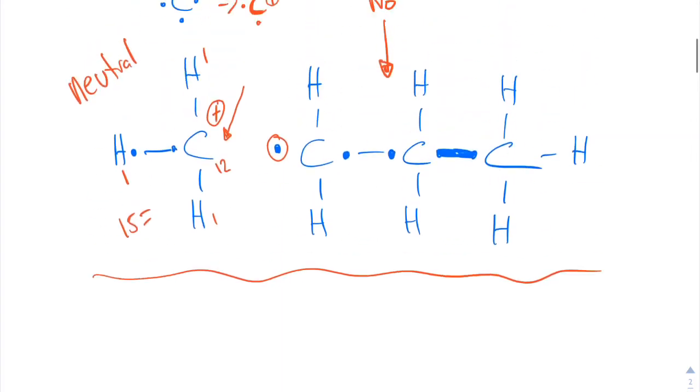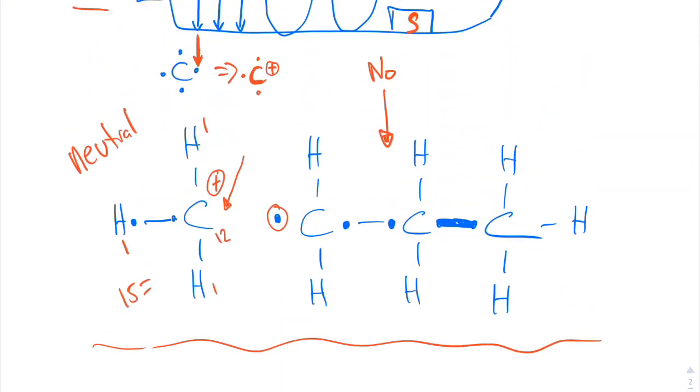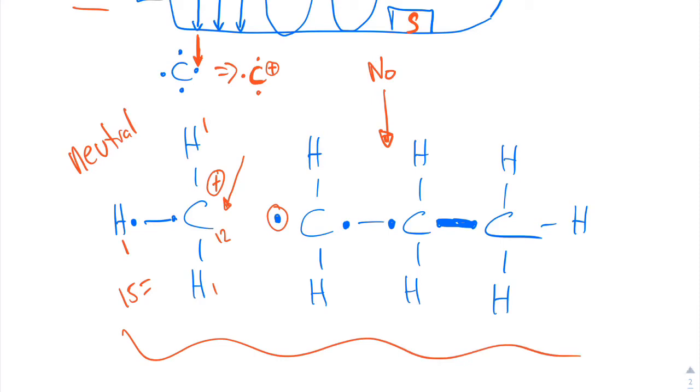It's like when we were breaking this thing apart up in here, when this was getting broken, it didn't smash an electron out of the middle and send just half of it through. It's knocking something off of a corner or an inner electron. It's turning it into an ion somehow, but it's just barely grazing off of the edge over here.